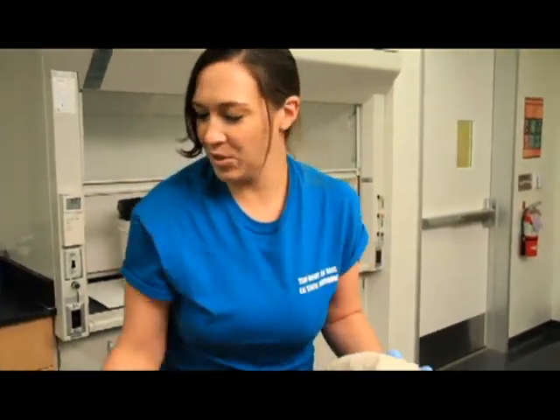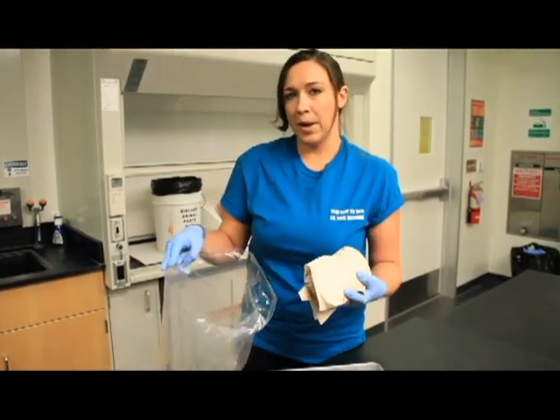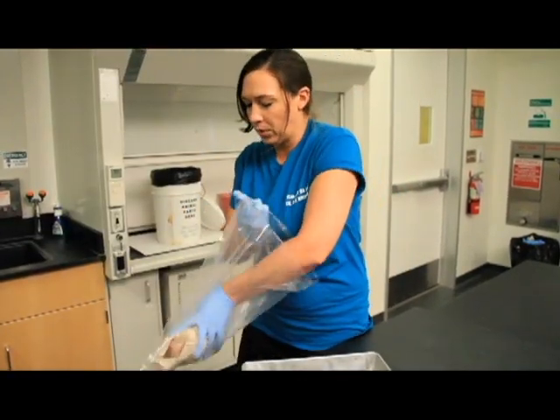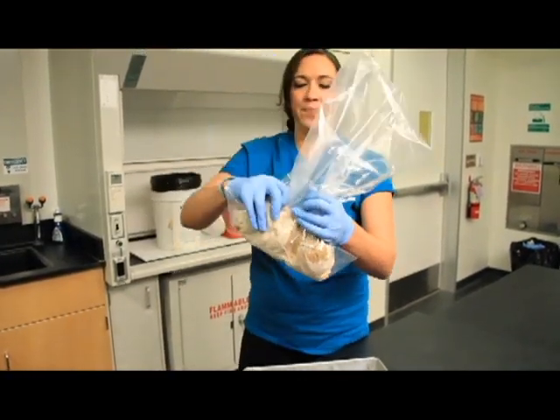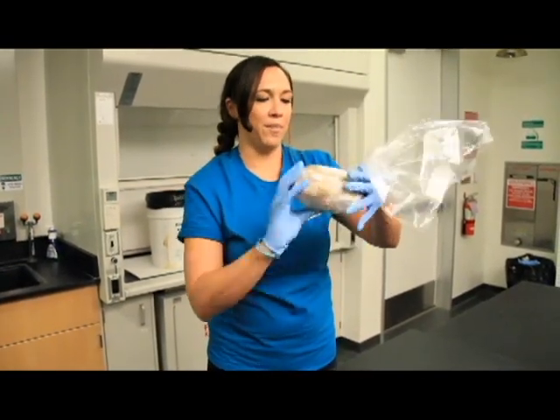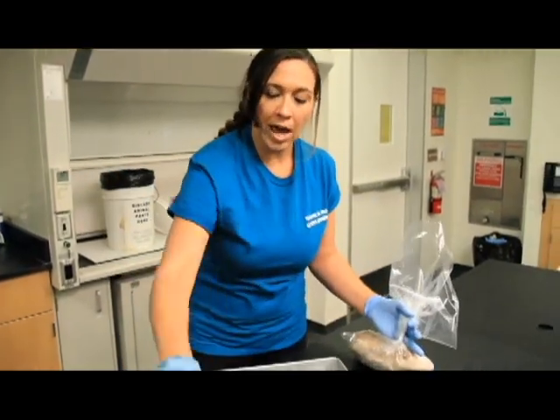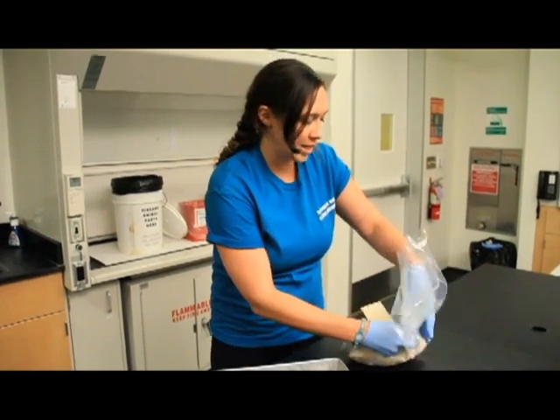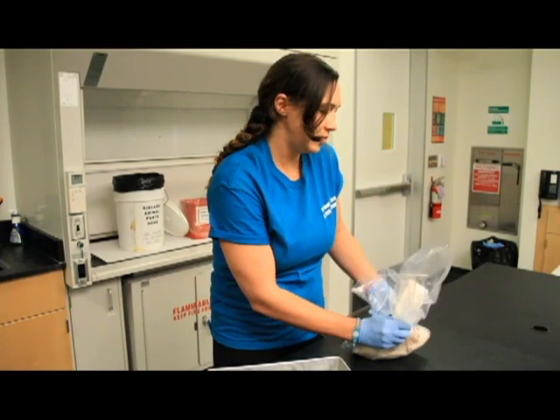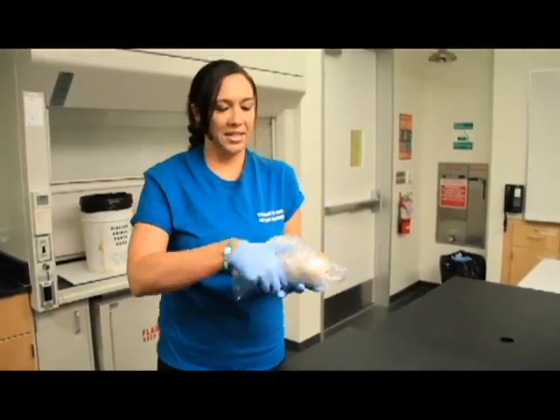Then we're going to place him in our plastic bag, and remember, never throw out your plastic bag. The original plastic bag that the pig came in can get thrown away no problem, but this plastic bag you have to keep all 3 weeks. So you're going to place him in the bottom, push out all that air, and then twist him up. Again, keeping as much of the air out of there as possible. And then with your tag with your name on it, your buddy's name on it, and your pig's name on it, you're going to twist tie that up so that you have a nice wrapped up pig. And then I fold the plastic down just like that.